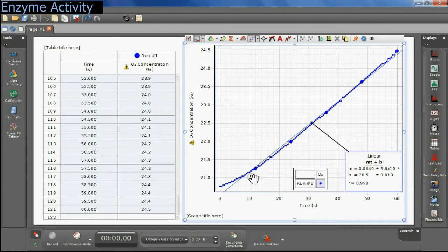Okay, so you're going to select 2 points on this line. Say one of the points is this, the other point is this. So X value for this point is 50, Y value is whatever, it's like 23.7 or so. Okay, so these are your X2 and Y2 values. And select one X1 and Y1 values. Say it's 10 and 21.2. And then make your calculations.